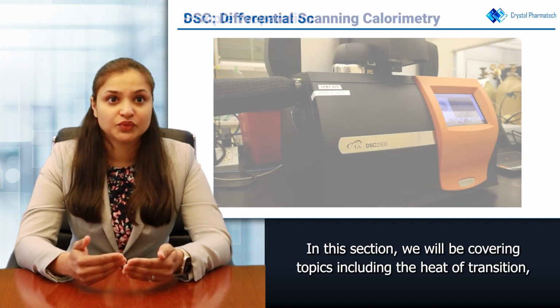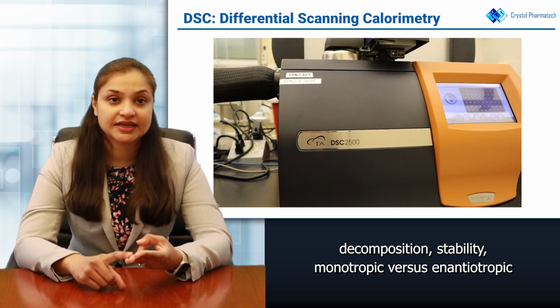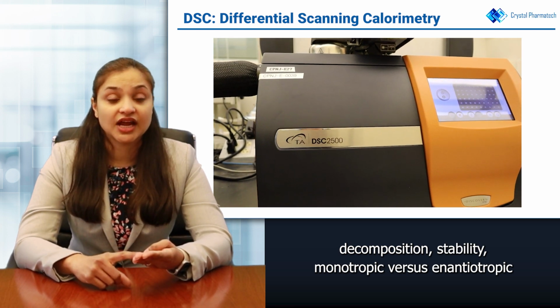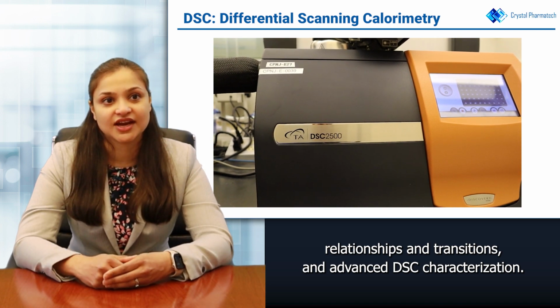In this section, we will be covering topics including the heat of transition, decomposition, stability, monotropic versus enantiotropic relationships and transitions, and advanced DSC characterization.